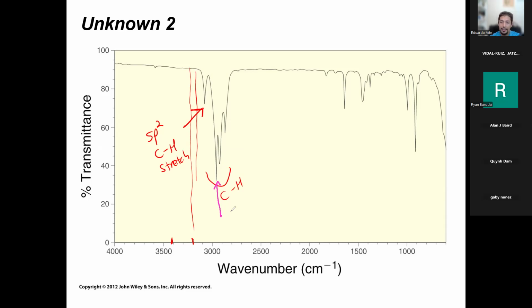An aromatic ring. So this is your aromatic carbon hydrogen stretch, right? You could have a ring and you have that H right there, and this whole thing is just the rest of the ring. So yeah, this is your aromatic carbon hydrogen stretch. This whole region in general is just carbon hydrogen stretches. And also notice you have the little band of hills up here, the overtones. So you have overtones right there.